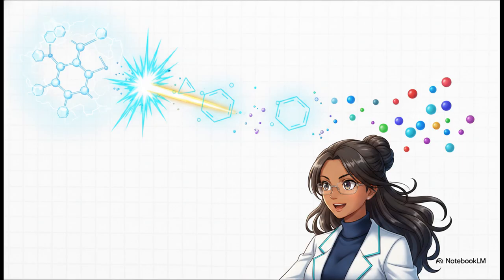But because it has so much excess energy, it quickly starts falling apart in highly predictable ways. It'll lose a hydrogen radical to form a superstable benzyl or tropylium ion at m/z 91. Further bond breaking creates a phenyl cation at 77, and even smaller fragments at 65, 51, and 39. We are literally watching the molecule systematically disassemble itself.